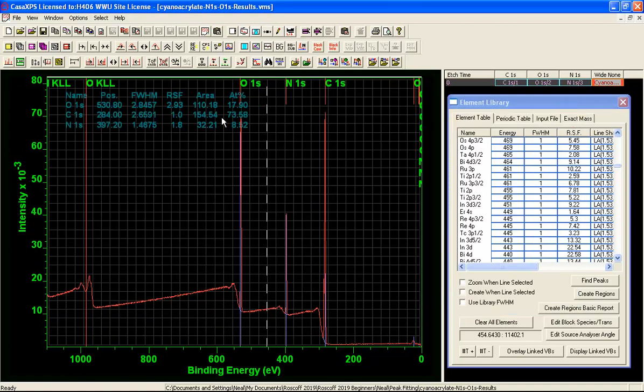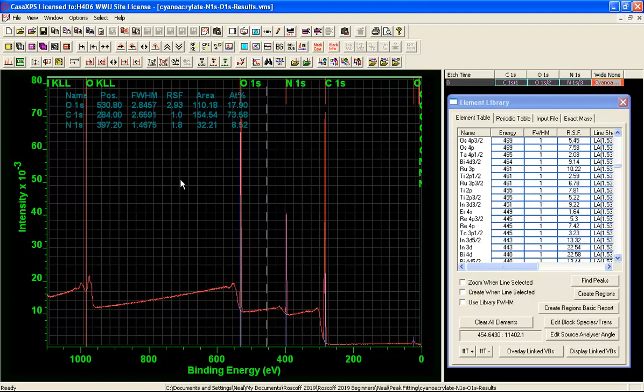The reason I am doing that is because I want to illustrate that these are Schofield cross-sections and not Kratos RSFs. And the reason for this is because these data have been acquired relative to a National Physical Laboratory instrument and so the transmission function is an absolute transmission function and is not a relative transmission function that would be typical of a Kratos system.